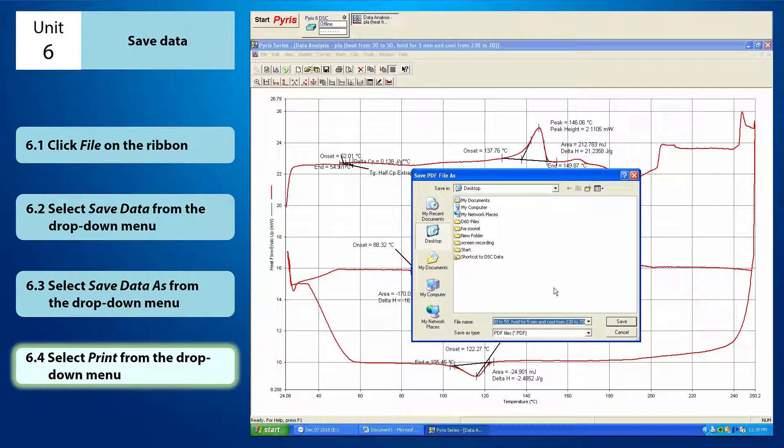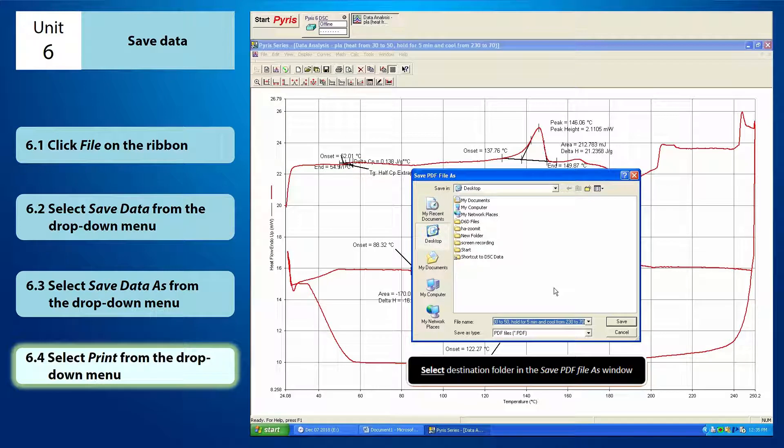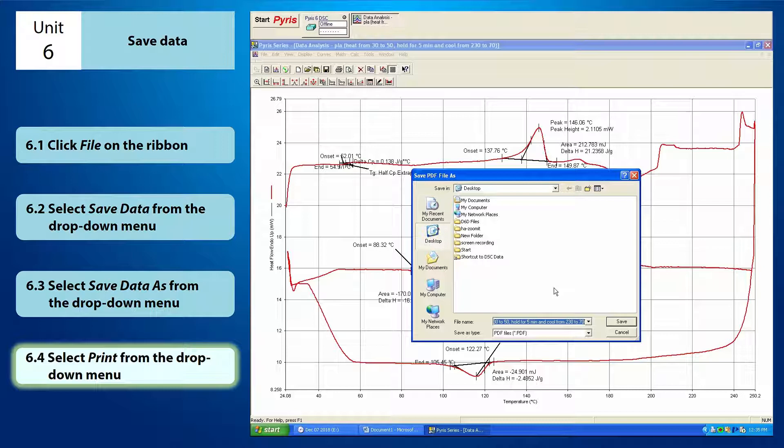This save PDF file as window will appear. You just have to select the destination folder where you want it to be saved.